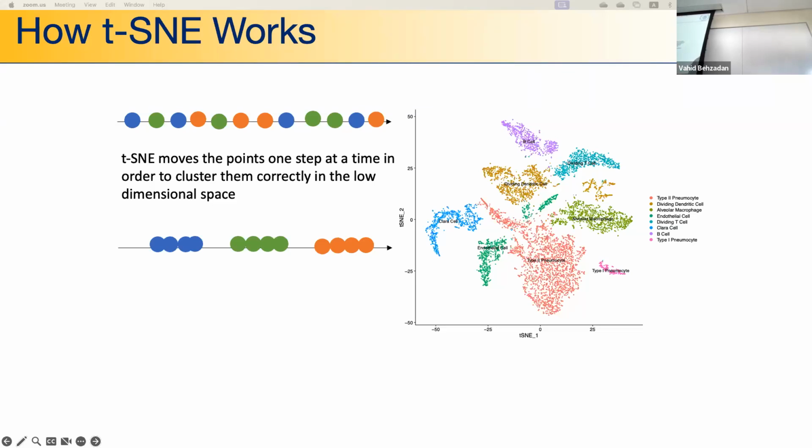So it makes sense that the majority of cells are lung cells. Right. But when you measure, let's say, Euclidean distance, and if the feature representation is essentially the same as gene transcription, shouldn't that be zero for all lung cells? No, because there is variability within each cell type. So what you're saying is that you should get this lumped together here? No, that doesn't happen in biology.